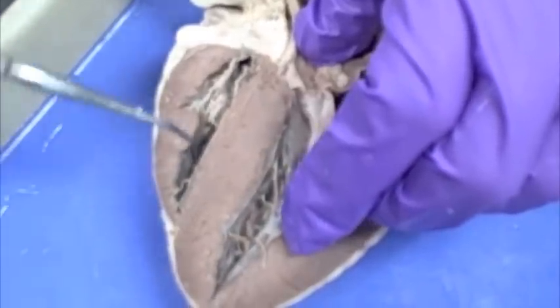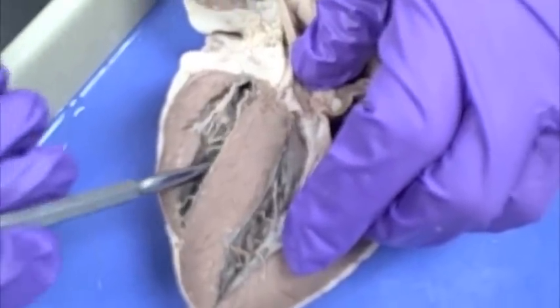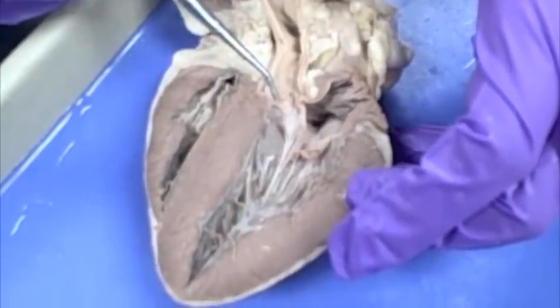From the right ventricle, blood is going to go to the pulmonary trunk or the pulmonary artery. It's going to be located way back in here but it's going to have the same structure as the aortic semilunar valve. We'll talk about that structure in just a second.